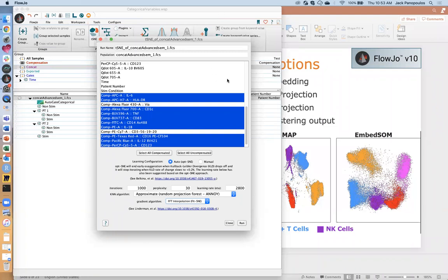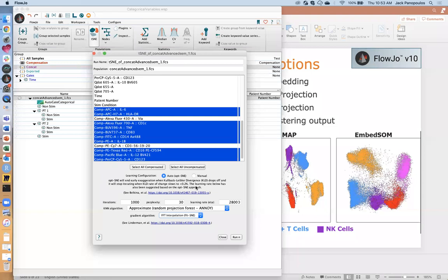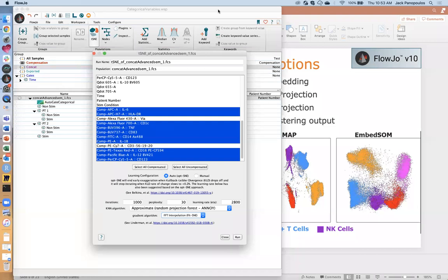If running manual, okay, so Anna's here. She could tell you all about tSNE. But she says, just use the learning rate as 1/12 the number of events. I have 40,000 events. So 1/10 of that would be 4,000, so the value would be 4,000. So I'm assuming 1/12 to be something a little bit less than 4,000, around 2,800, right? So hopefully this will be good, and then we'll go from there. But that's a very good tip, and thank you, Anna, for saying that. So just, if running manual, use 1/12 the number of events.